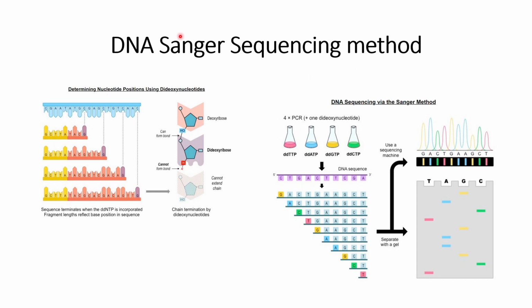In this video we will discuss the DNA Sanger sequencing method. From the figure on the left side, we will understand the principle behind this DNA Sanger sequencing method. So this is the deoxyribose.